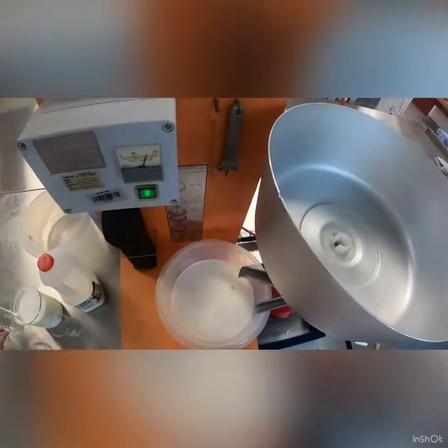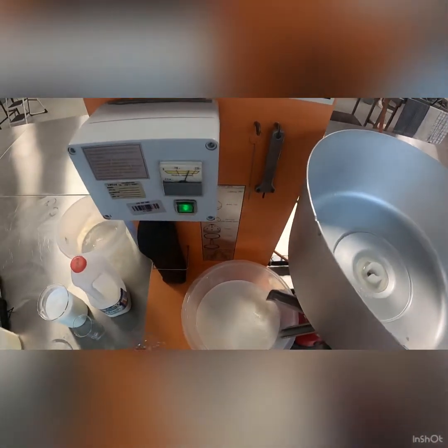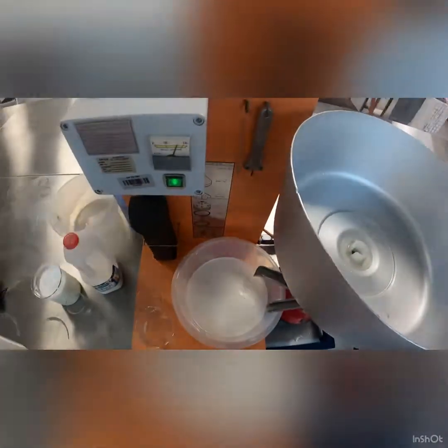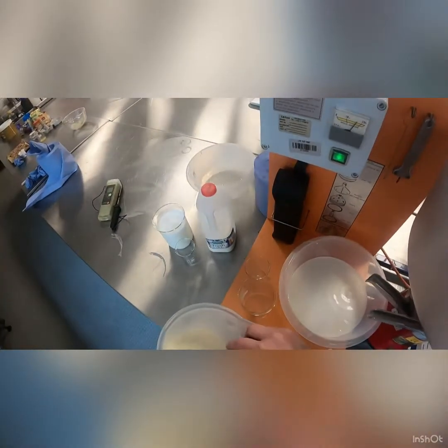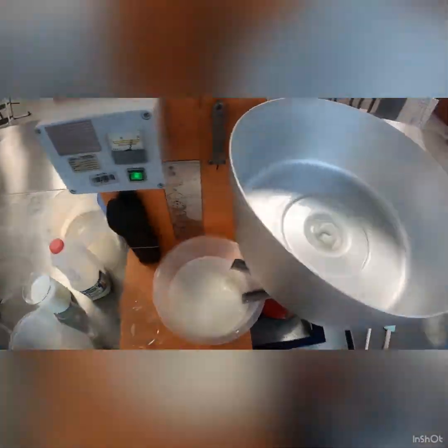Now when it gets back to that watery phase again, where we just want to have water running through the machine, we're now going to run our raw milk sample through. We have about one liter of raw milk in here. I pre-weighed the beakers and I'm going to run it through the machine as I did with the first sample.